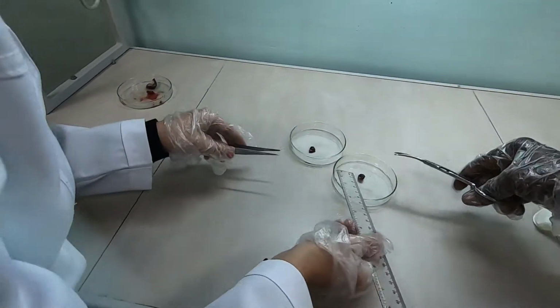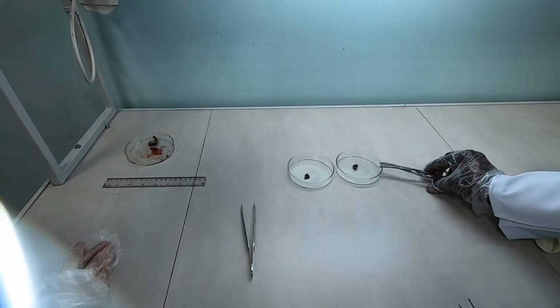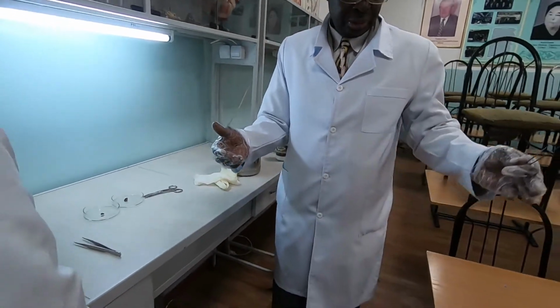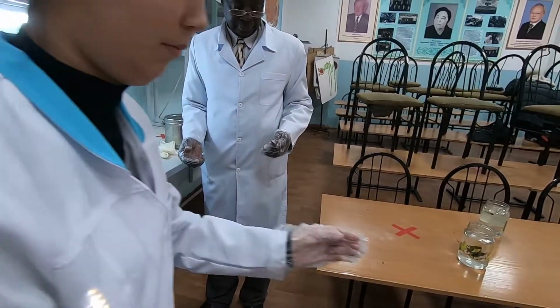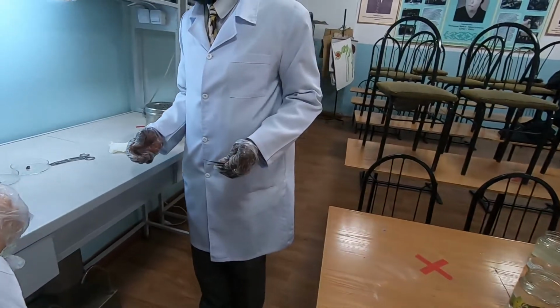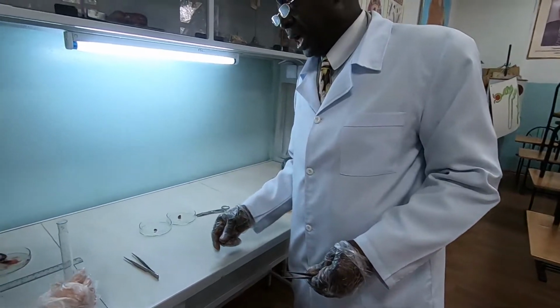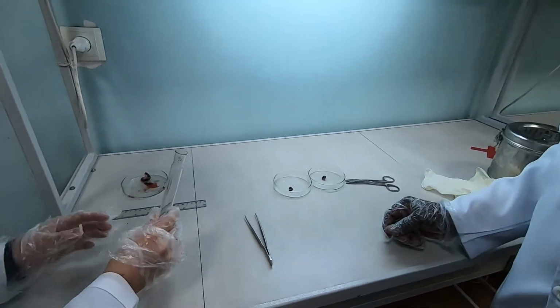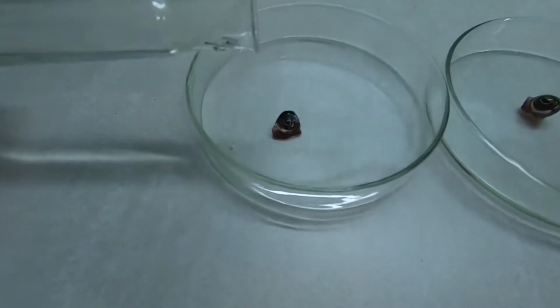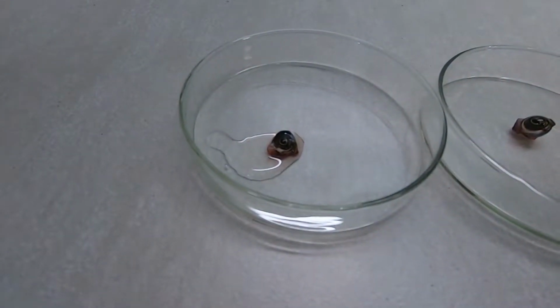So what we do is take the solution of Ringer and just add a little here, just some drops. Okay, that's okay.